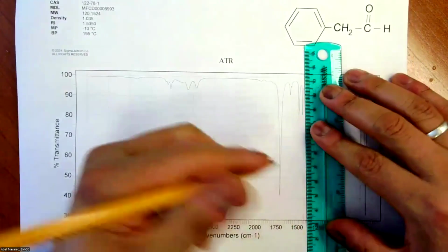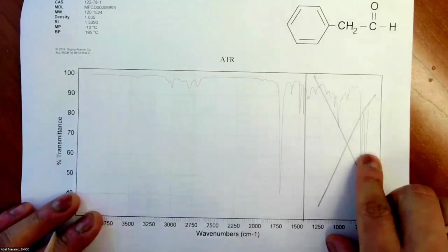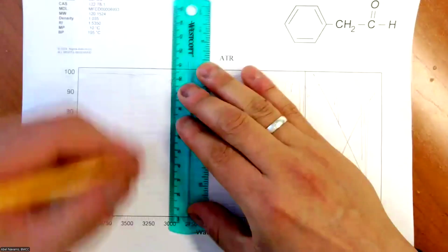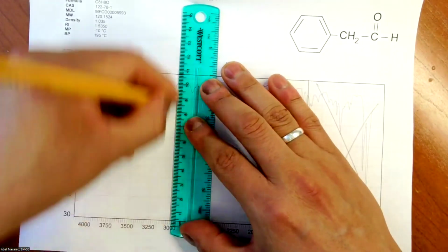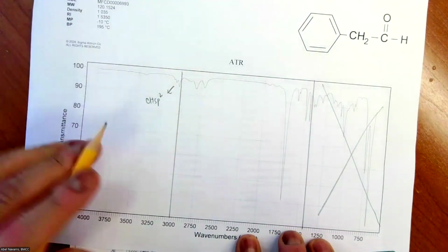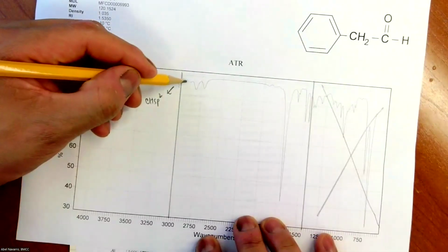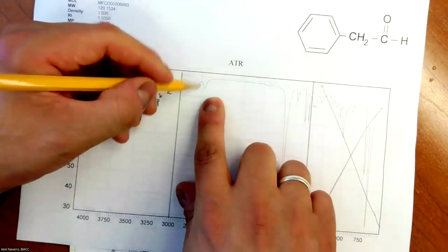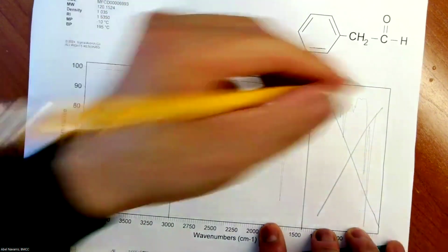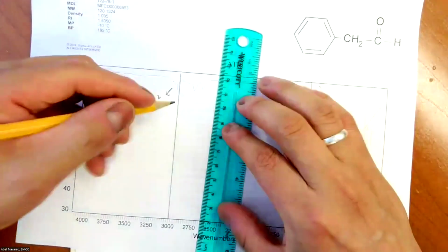Ignore the fingerprint. It's optional for you to trace that line of fingerprint. Let's go this way. Nothing on the 3000 line. CH sp2, right above 3000, which makes sense. CH sp3 a little bit, but not that much. But I see those two humps, those two hills here. They are the aldehydes, 2700 and 2800.